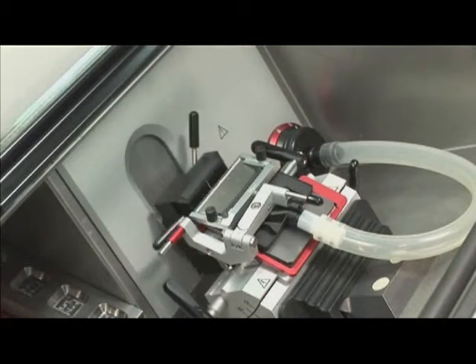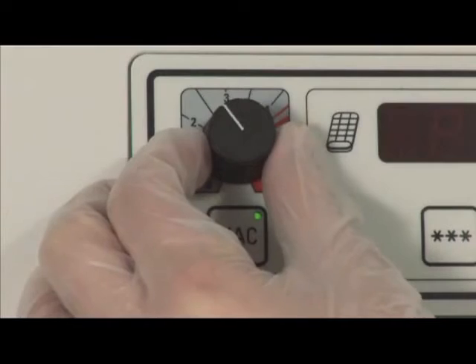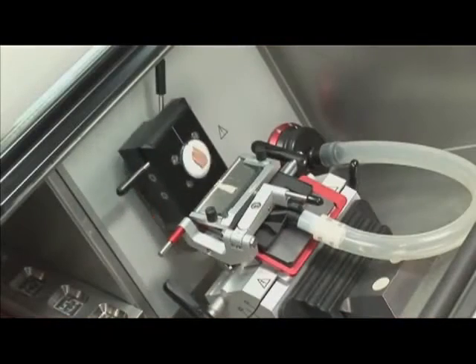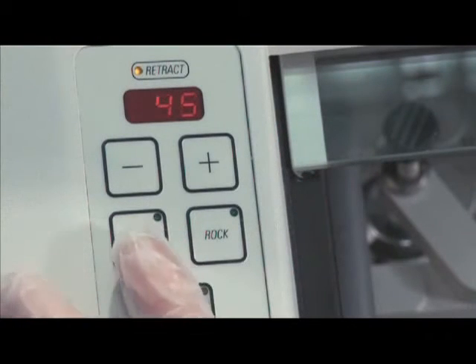The intensity of the vacuum can be adjusted continuously, depending on tissue type and size. Already during trimming, this prevents the contamination of the cryo-chamber with section waste.